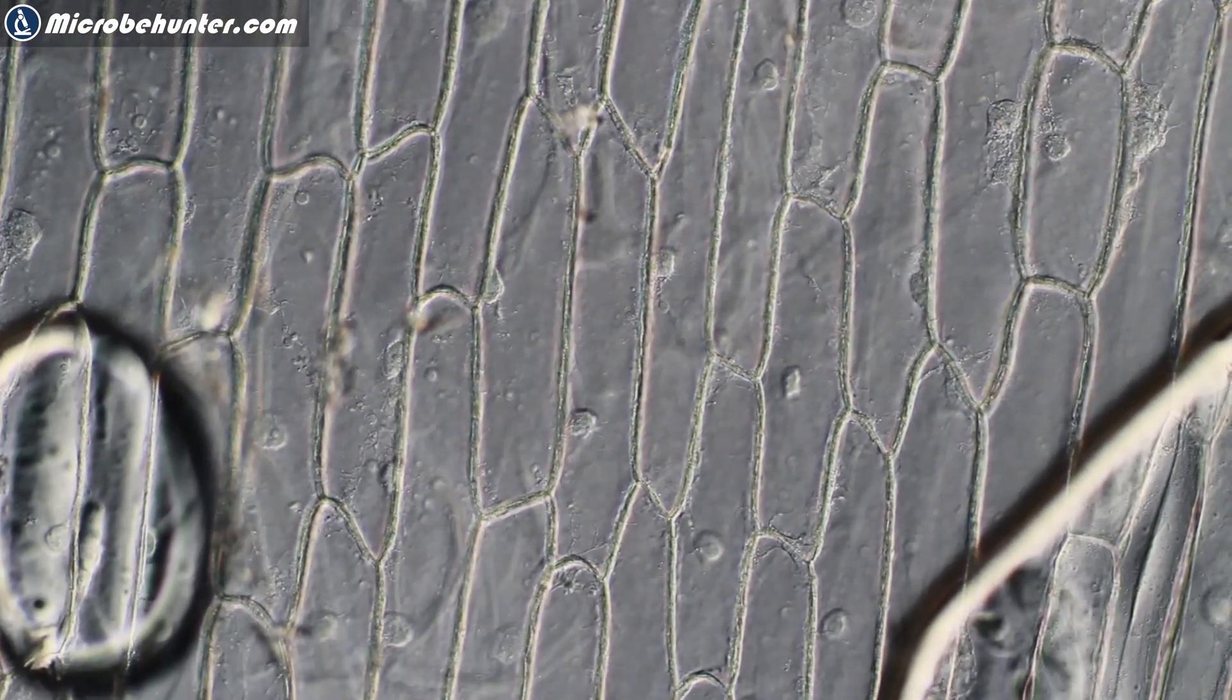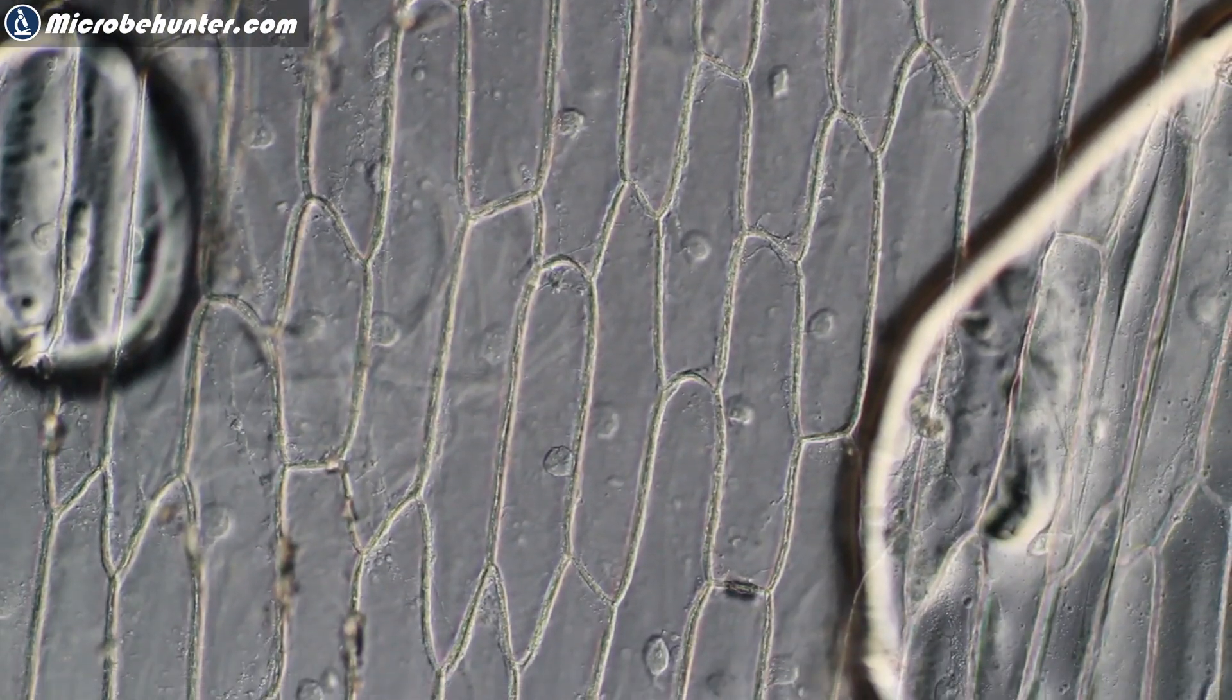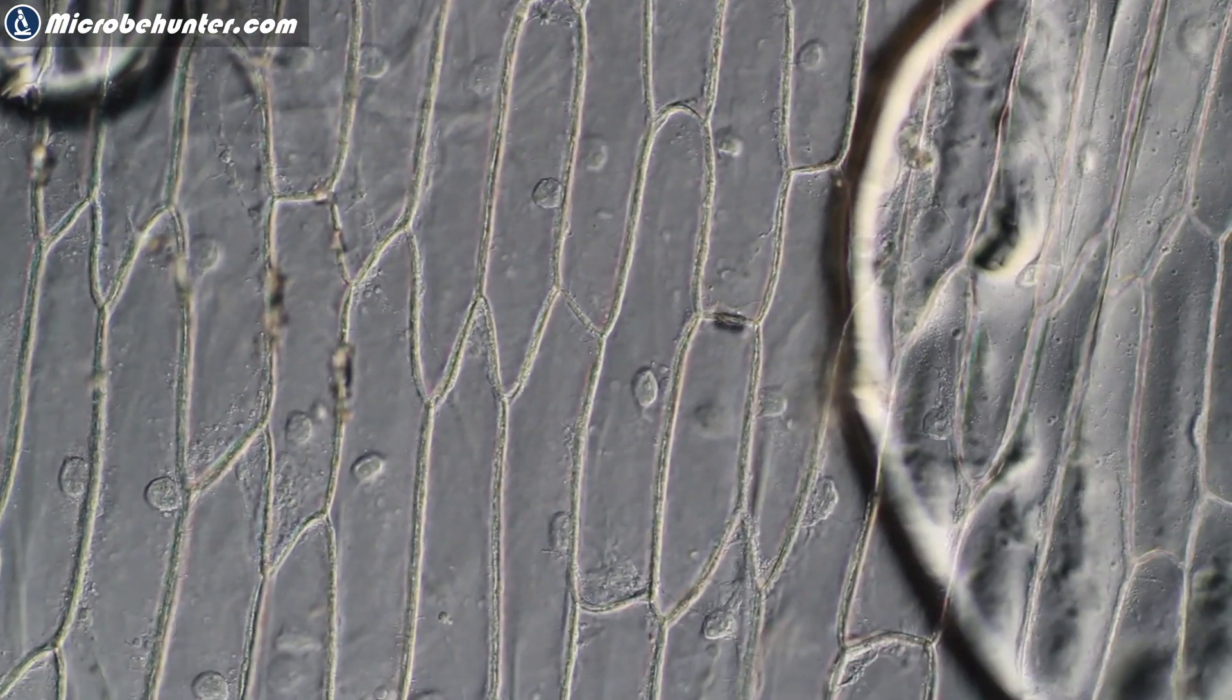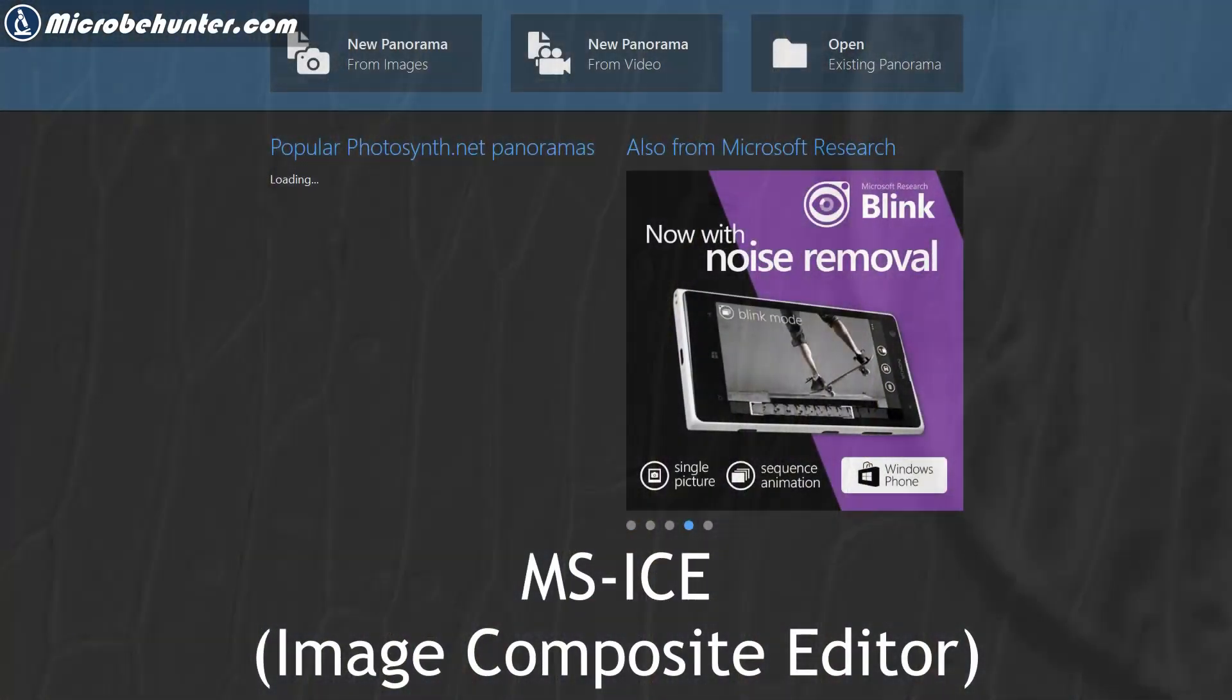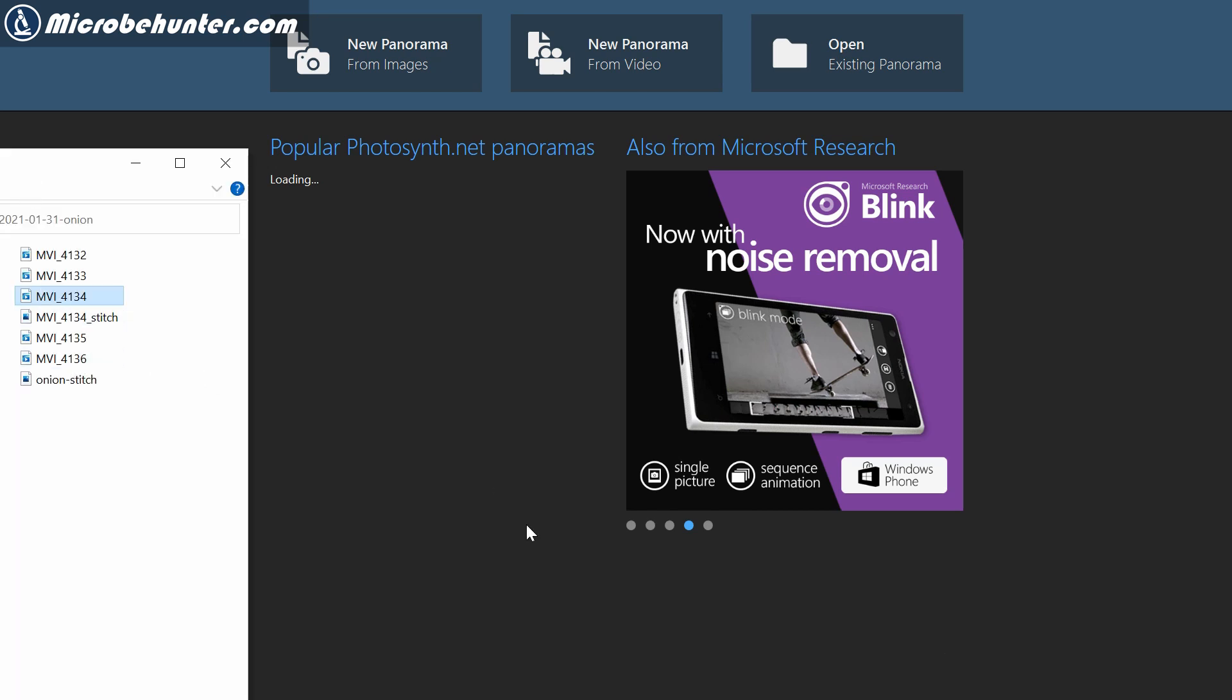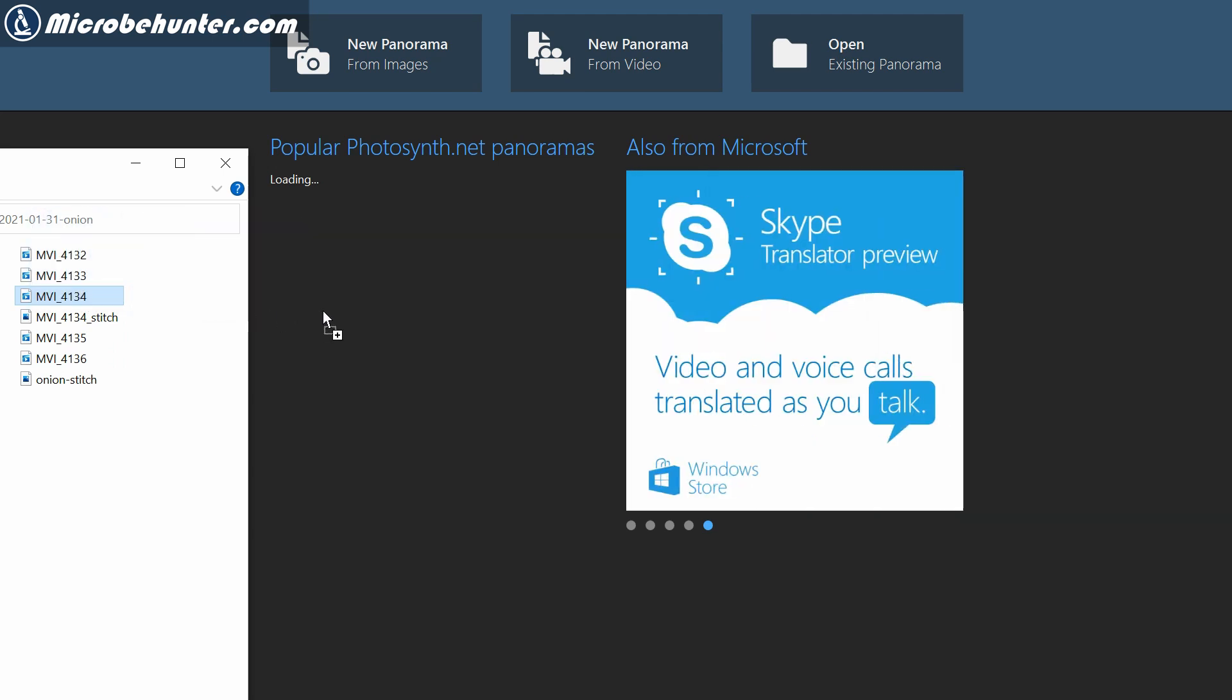I'm going to be processing this video later on using a software that is called MS ICE, Image Composite Editor. Here I opened the program and I'm simply dragging and dropping the video, in this case an MP4 video, directly into the software.